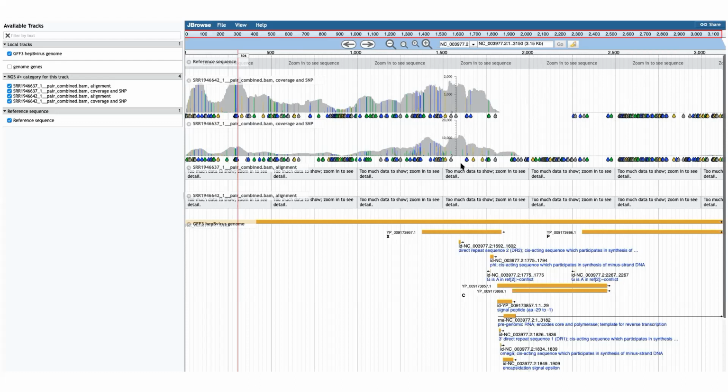But it is not consistent throughout the whole genome. This is the whole genome, and as you can see, this whole thing is covered. How do we know which regions have more or less coverage? What file gives us that information?